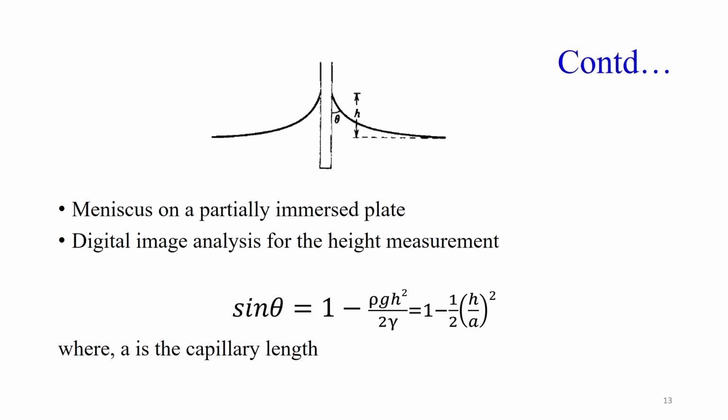So, further let us say this is the meniscus on the plate, this height is touching up to the edge, and this angle is theta.